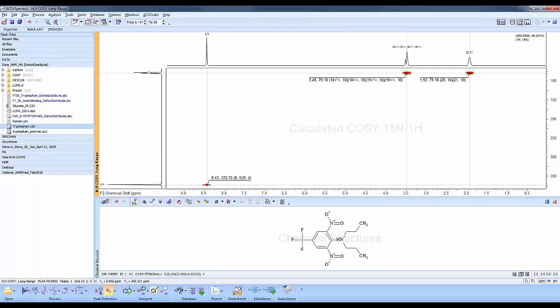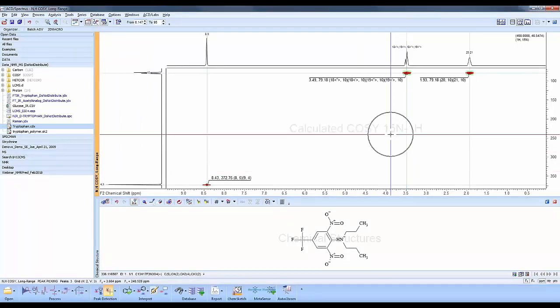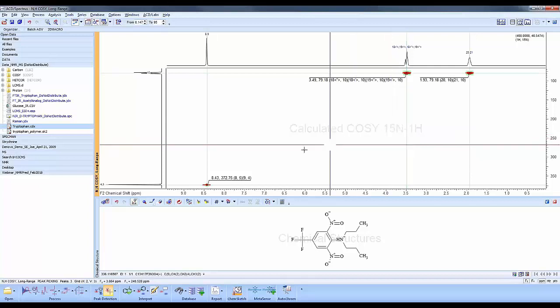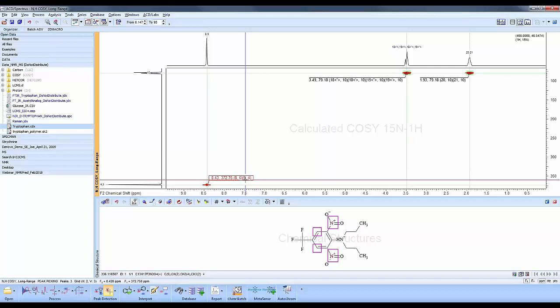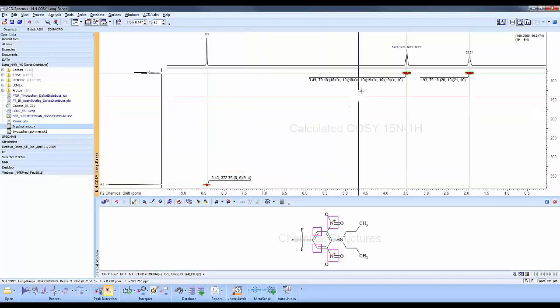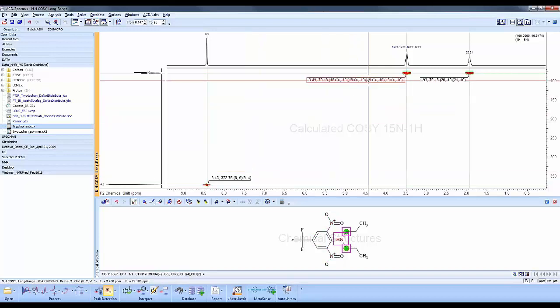This will search our internal database and predict for proton and nitrogen NMR. Here you'll see it says nitrogen proton here, and we can see what the assignments are. We expect that this NO2 group is around 372 ppm. The reference solvent in this case is ammonia, and the salt, the NH plus, we expect around 79 ppm.